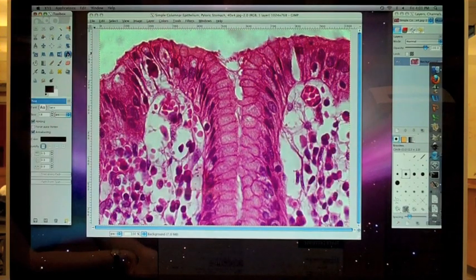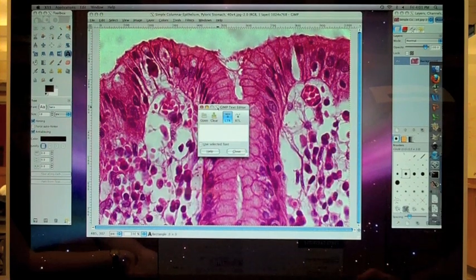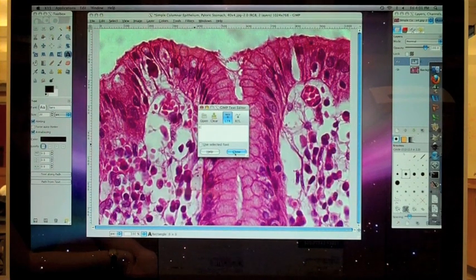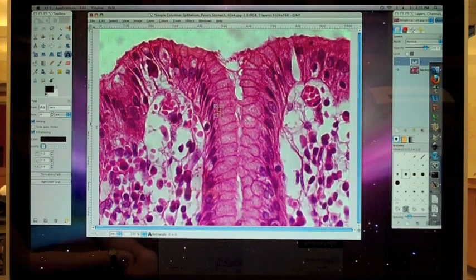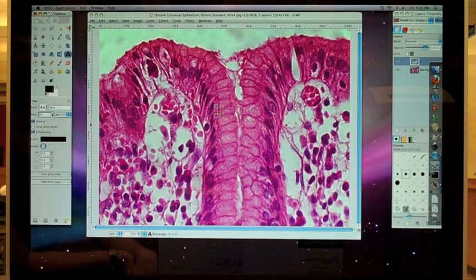Find the large A in the toolbox on the left. This is the text tool. Double click on an area of your image where you'd like to label. Type your label into the box. In this case, E is for epithelium.